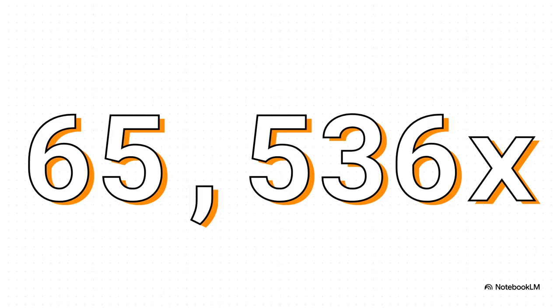Get this. It is 65,536 times faster. Let that number sink in for a second. That's not a typo. This one beautiful approximation makes the calculation nearly 66,000 times more efficient.